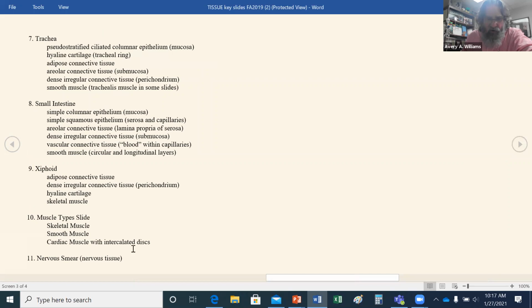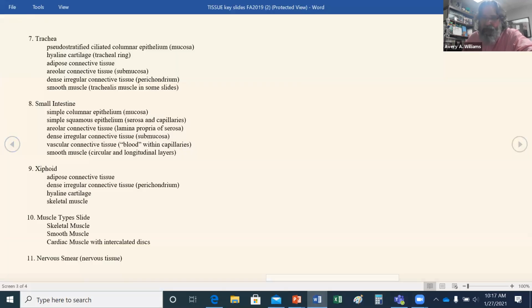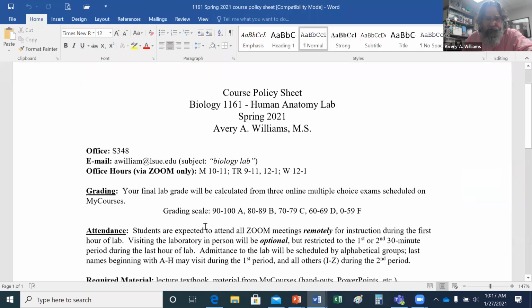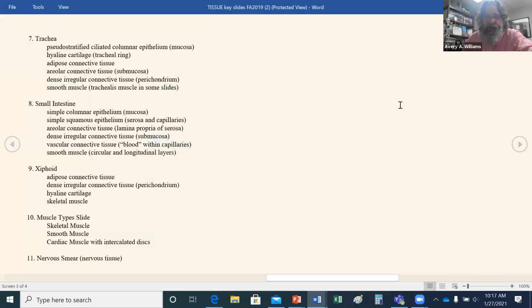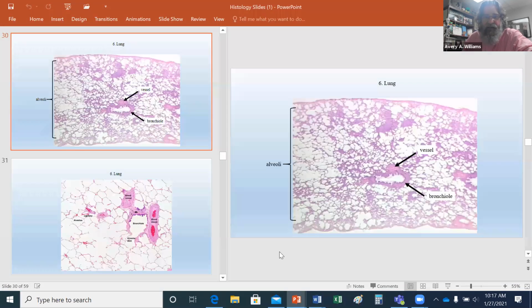Okay. And so what do we, I'm trying to think where we stopped today. I think the xiphoid. I can't remember. Or you know where I could look? It's on the course policy sheet. Let me look at that. Let me do this. Let me open. Where is it? There it is. Right. Okay, yeah, xiphoid. Okay, I'm trying to figure out where we're stopping. Okay, so here we are at the lung. And there we are.